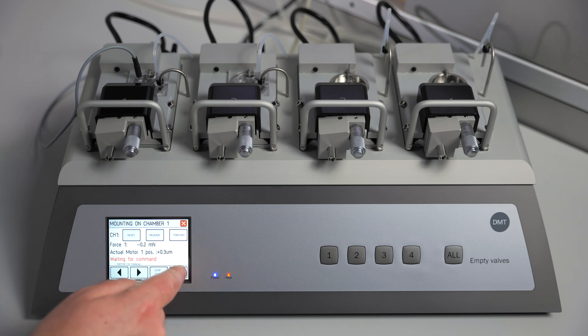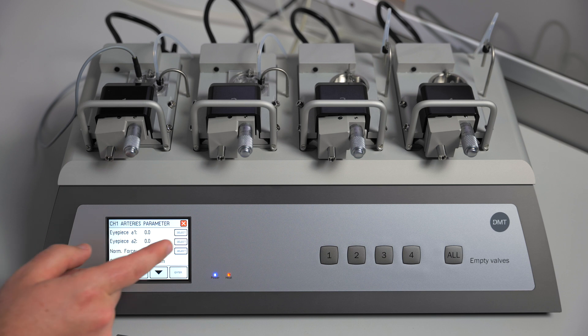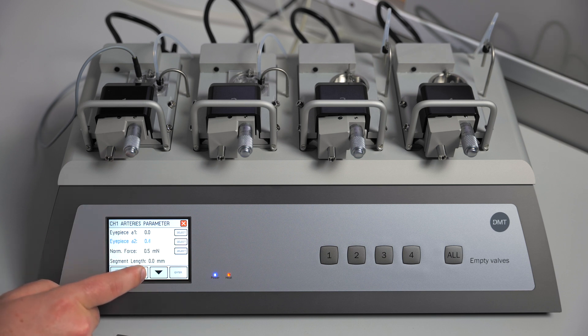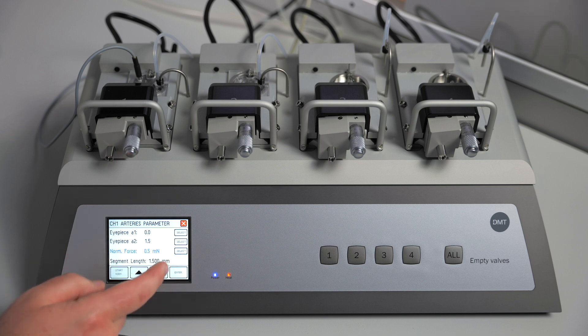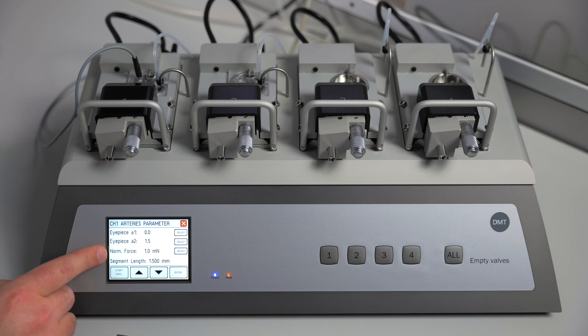You can now go to the artery parameters — this is where you will enter information about your specific vessel that day. Our first eyepiece endpoint will be zero; our second point will be the length of our tissue, in this case 1.5. We are going to use a normalization force of 1.0. The steps in the automated normalization will depend on your normalization force: a smaller normalization force will result in more steps, a higher force will result in fewer steps. We are now ready to begin the automated normalization on channel 1 — press start normalization.